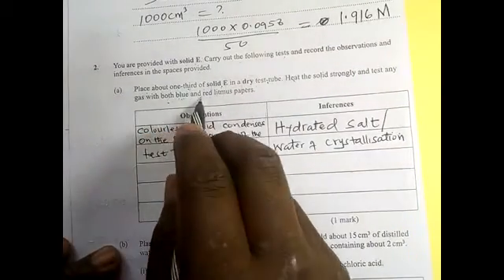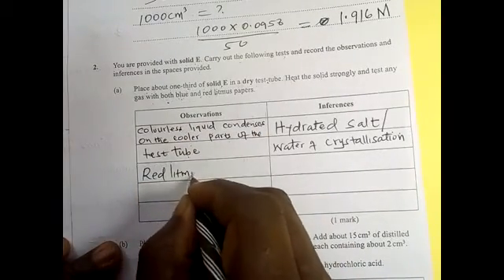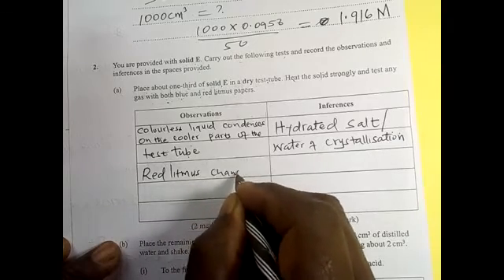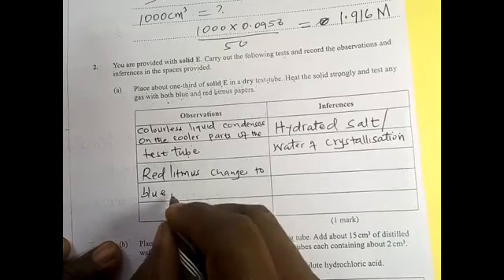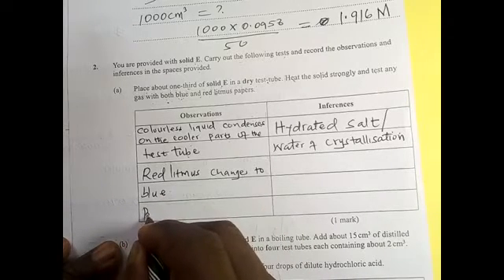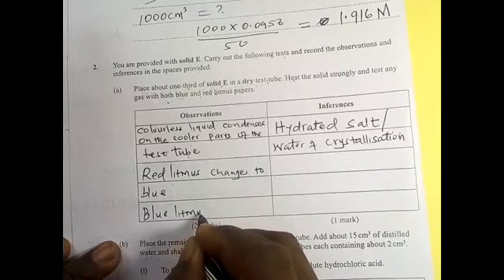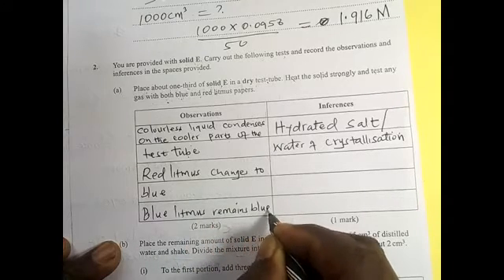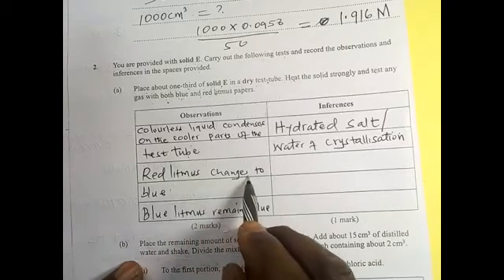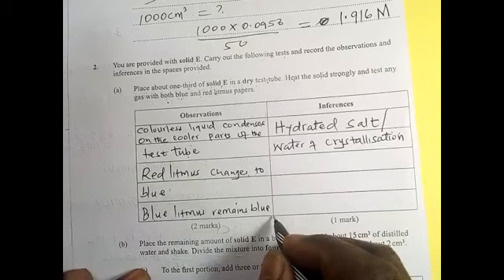What happened to the red and the blue litmus paper? Red litmus changes to blue, and then blue litmus remains blue. So if red litmus paper changes to blue and then blue litmus paper remains blue, that confirms that the gas that was produced is a basic gas.